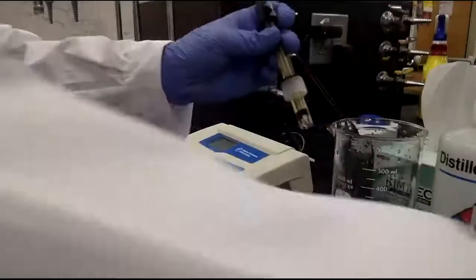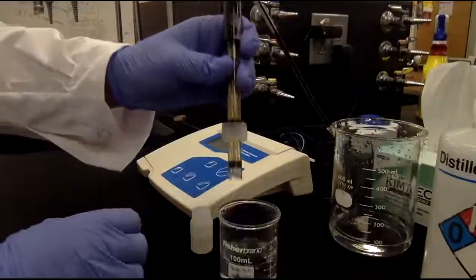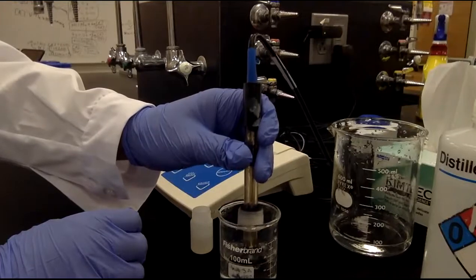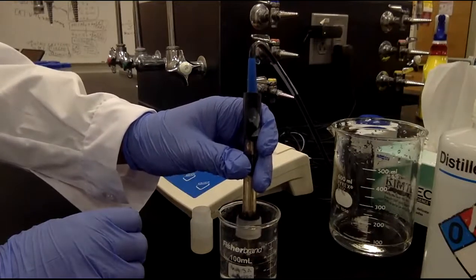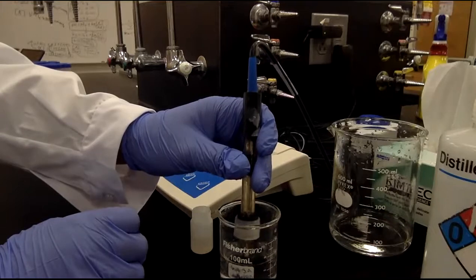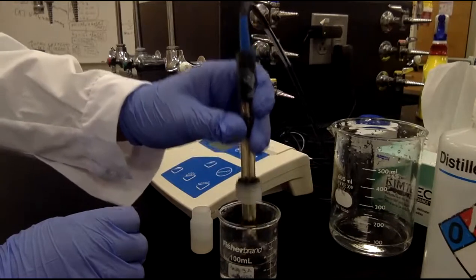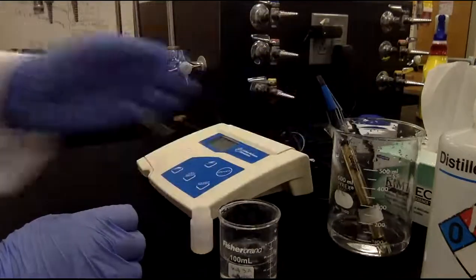So, do it in the second one, which is the strong acid. Just hold it. How do you read the number? Record the number. 7.05. I'm gonna go ahead and put that in.